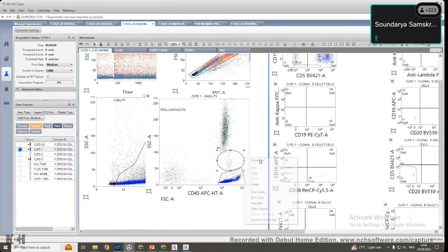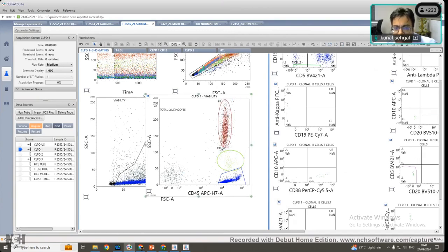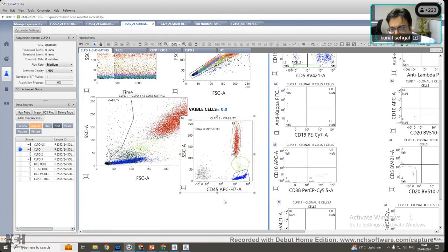Monocytes. And the population above that? Granules. Neutrophils. Because this is peripheral blood, this is neutrophils, and there will be some eosinophils scattered above. But this patient had a 15,000 WBC count with almost 75-80% lymphocytes. He is an elderly male who walked into the clinic and he has lymphocytosis.